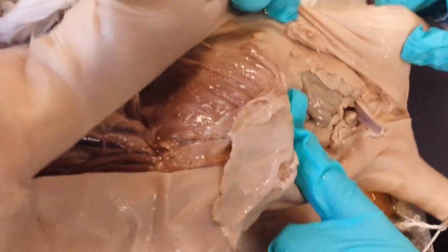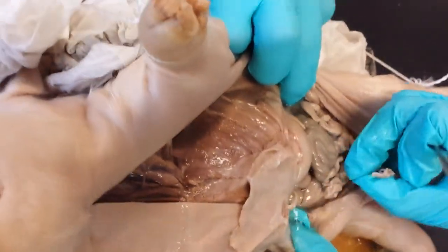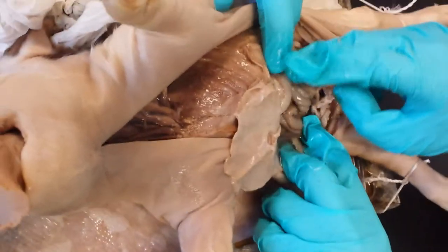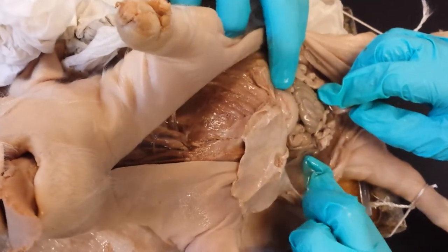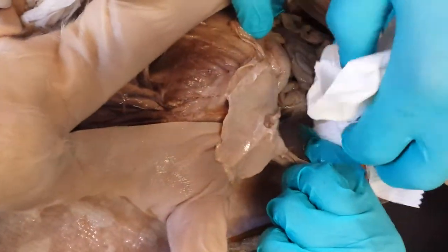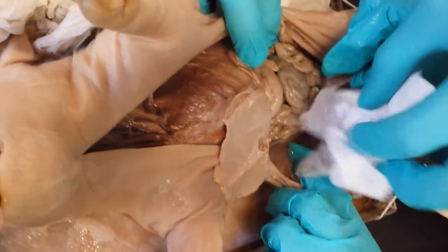So locate the large intestine and its point of attachment to the small intestine. The small one is coiled thin. Is this the liver or is it the stomach? Because here's the small intestine all over. Okay, here. So the small one is at the right. Oh, no. Are you sure that's not the small intestine and that'd be the large intestine? See, because I always thought the large intestine just went around the small intestine.